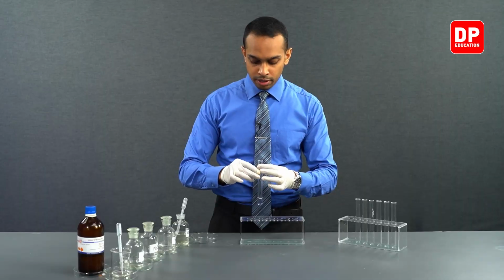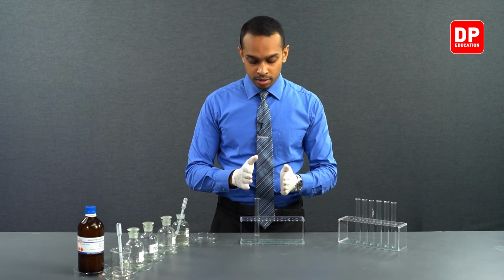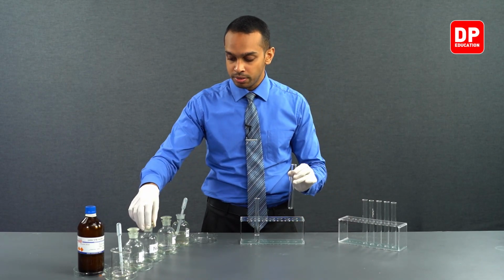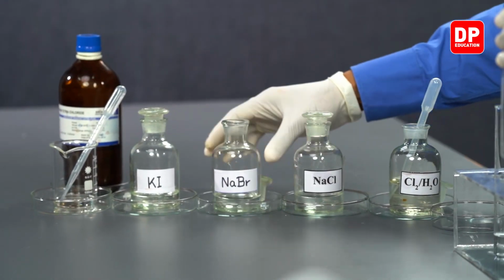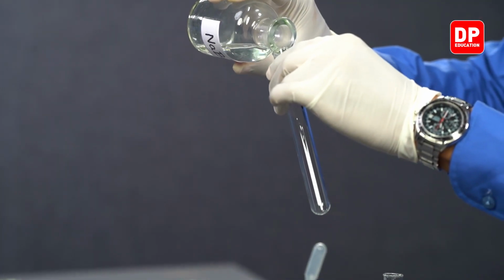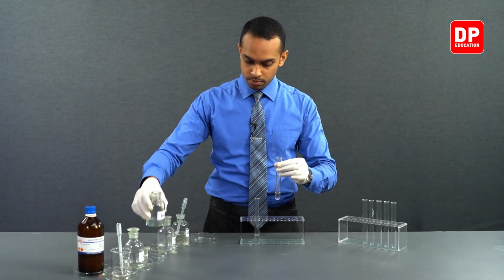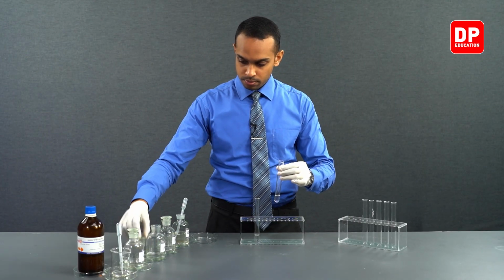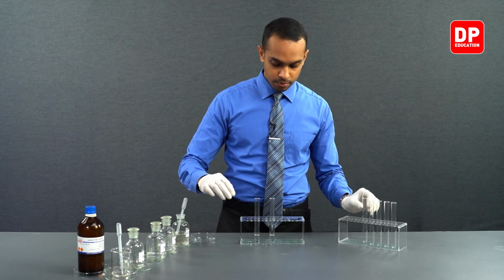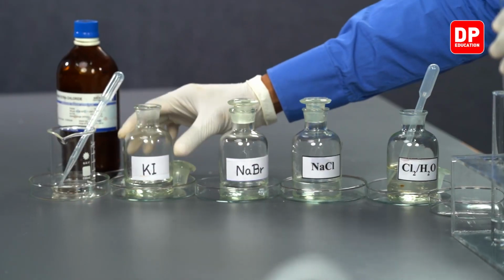And we'll place it here. We'll take 3 test tubes and now we will transfer small amounts of each of the halide solutions first. This is the bromide ion solution. And we'll take the iodide ion solution as well.